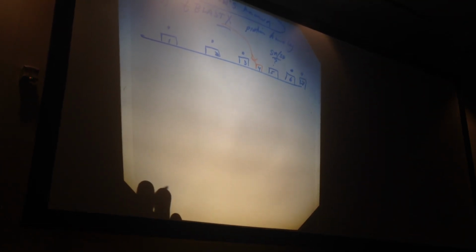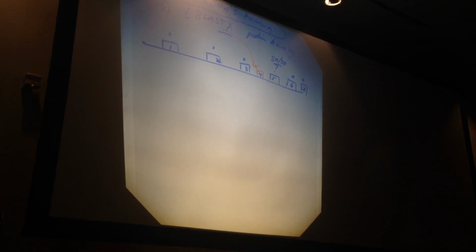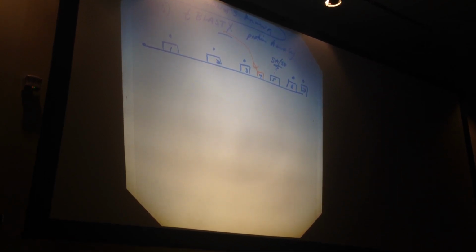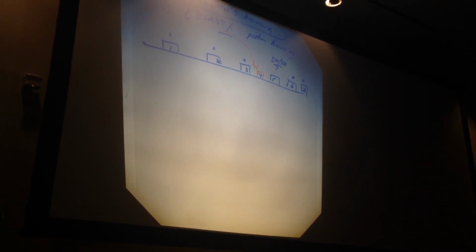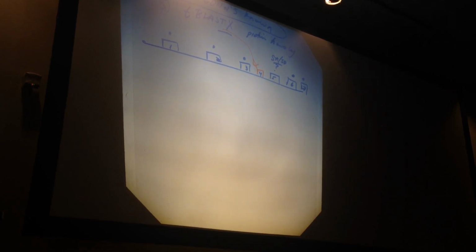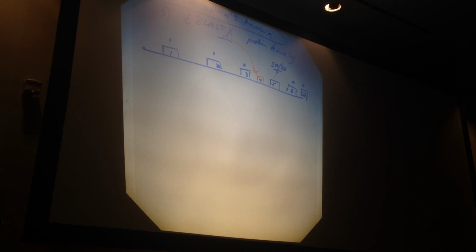So what Affymetrix did was they scanned the entire genome and they said, well, we want to know whether any one of these pieces are in your mRNA. We don't want to lose any bits of hybridization in your mRNA. So what they did was they figured out a technology to bind single-stranded oligonucleotides to chips.